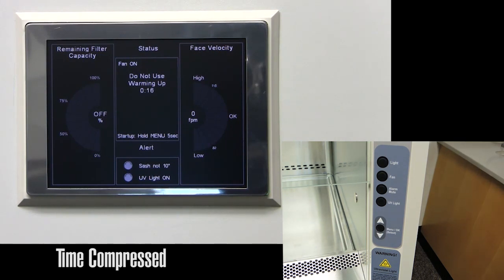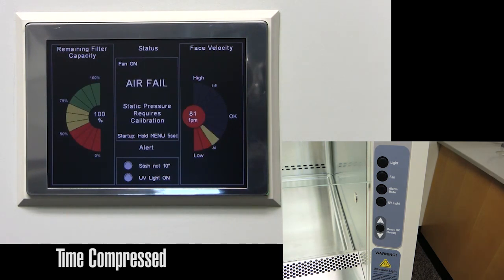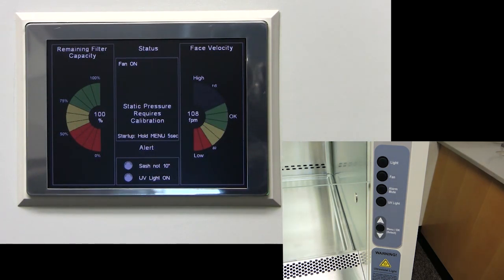Once the ramp up time is over, the alarm will sound as the cabinet drops below the specified feet per minute. NSF requires a face velocity between 100 to 110 feet per minute. We will now show you how to calibrate the screen.